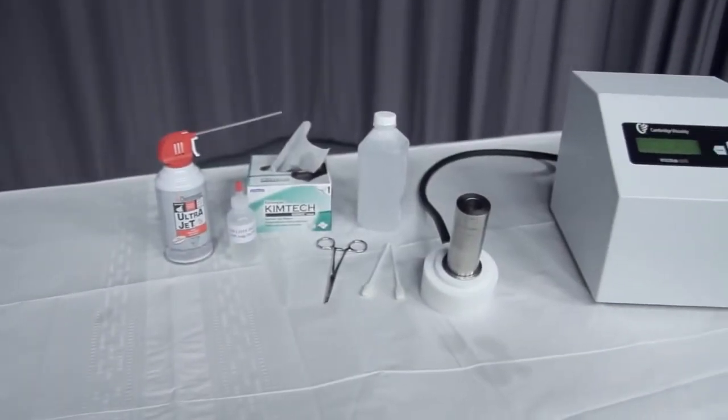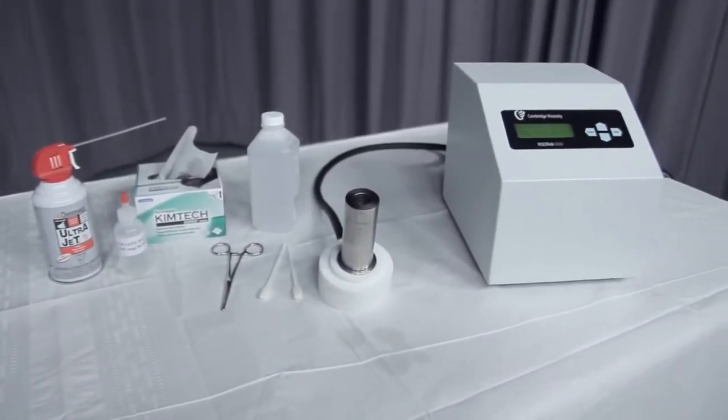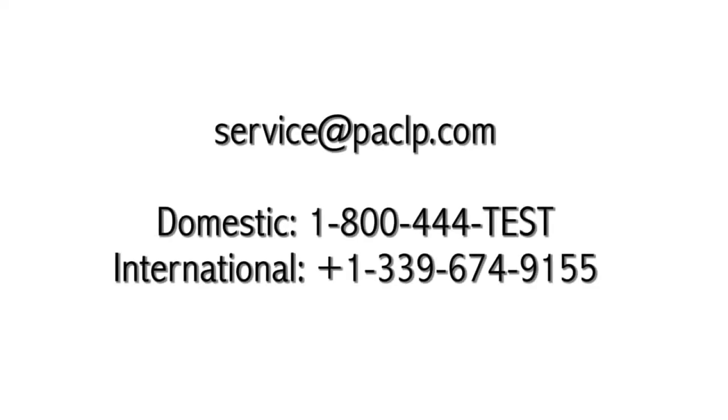You have now tested a sample and cleaned the measurement chamber of a VSCOLAB system. Please contact the PAC Service Department with any questions.